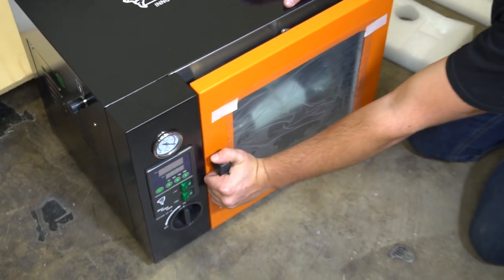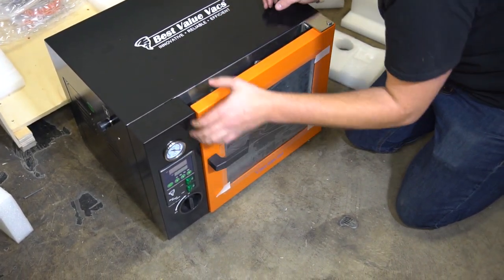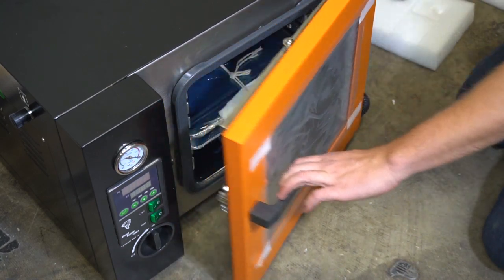Now you can open your handle, and the door might be a little bit stuck. You can get that open by either prying it away or just flicking the end of the gasket with your thumb, and it'll open right up.